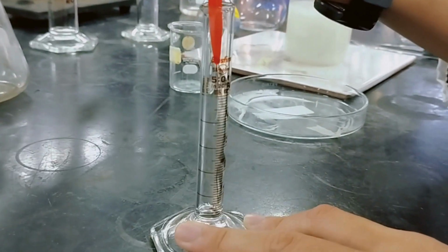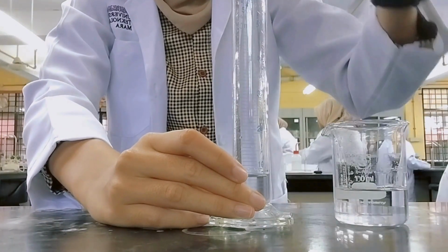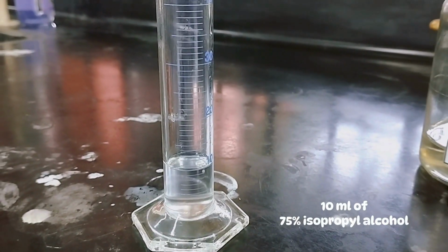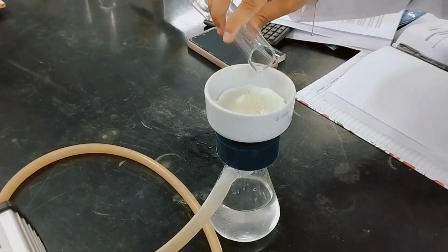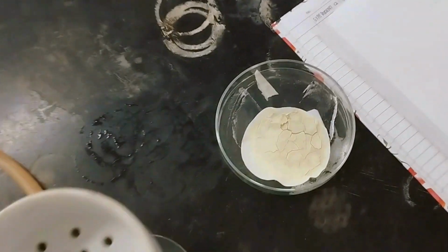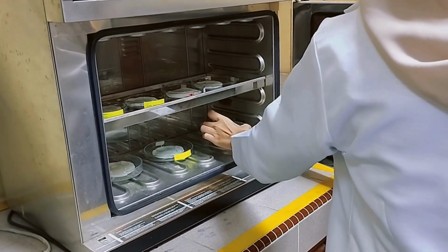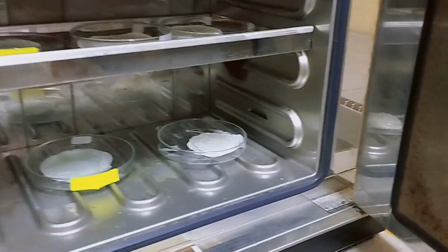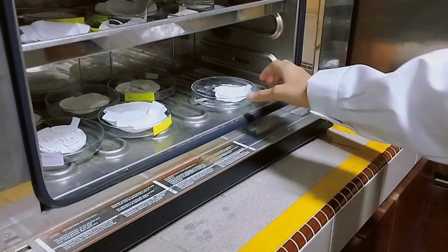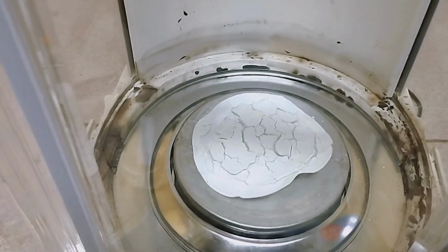Next, measure 5 ml of distilled water to wash the precipitate 2-3 times. Rinse the precipitate again with 2 portions of 10 ml of 75% isopropyl alcohol. Remove the paper and place it on an evaporating dish. Store it to dry in the oven for 24 hours at 60 degrees Celsius. When the white precipitate is dry, weigh the filter paper plus the precipitate. Lastly, record the mass and calculate the percent of phosphorus in your original sample.